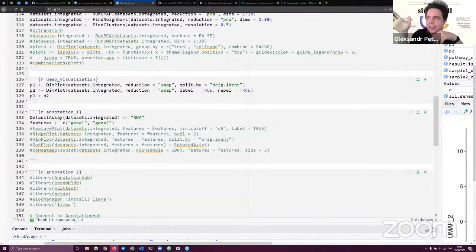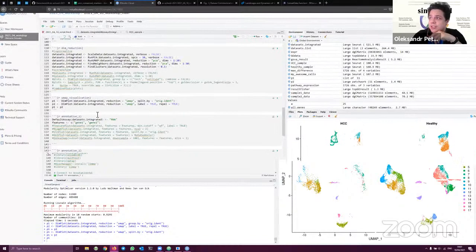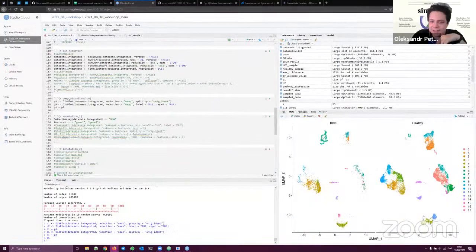So just tell me a few markers you will find. If you Google that, like B cells, human markers, you will see some papers in the very first results, which say, okay, so this gene was detected in the B cells. Just name a few of those to me, and we'll try to plot it and see where we probably have the cells. This is the number 1 option how we can identify these cell clusters. The number 2 option will be a little bit more interactive and fun, so it will follow after.